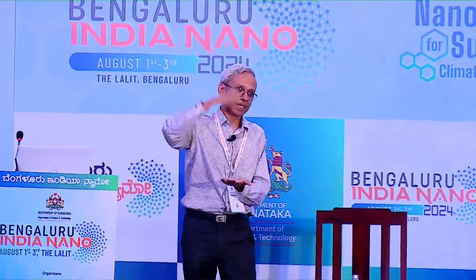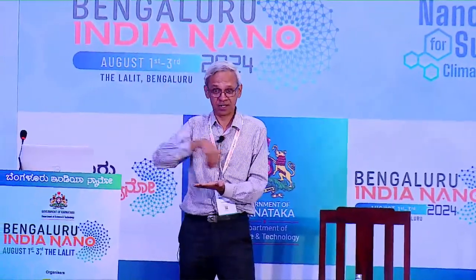We can go back and say how the scatterers are present in real space, and therefore get information from the specimen. Electron diffraction is a huge field in itself, and I don't have the time, unfortunately, to talk about the physics of diffraction, but I hope all of you have encountered X-ray diffraction and things like that. The physics is very similar, but the details are quite different. So I will leave it at that.